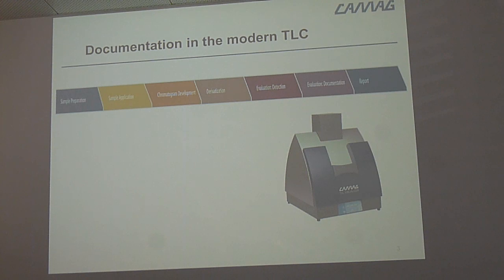You have this also in the instruction manual, and you have it also in the catalog. So these are always the same colors. If you have it on the instrument, sometimes people say, come on, these stupid colors, get rid of them. But I think it's quite good to differentiate where you are. It gives you an easy understanding.